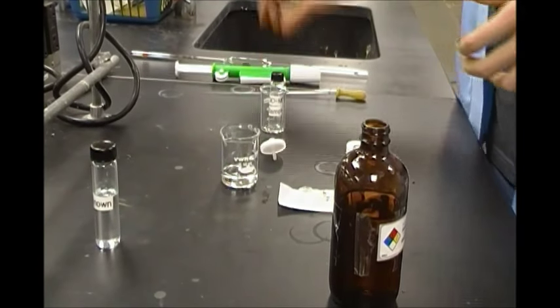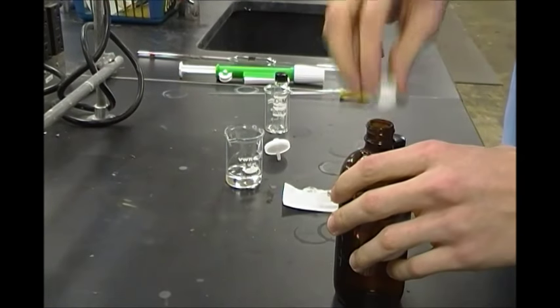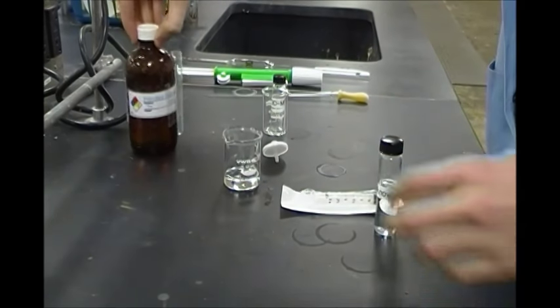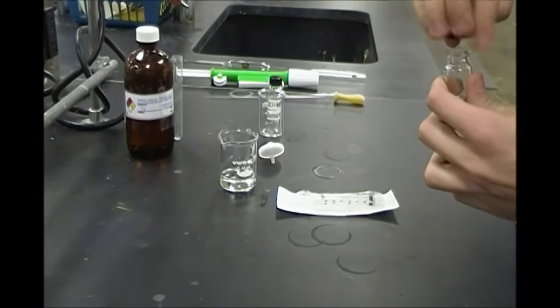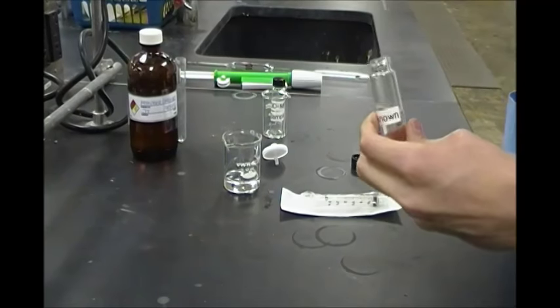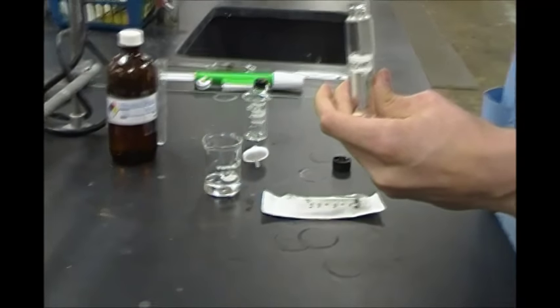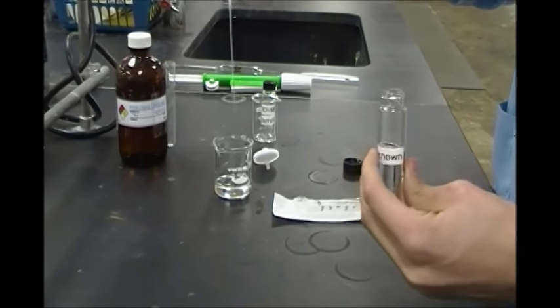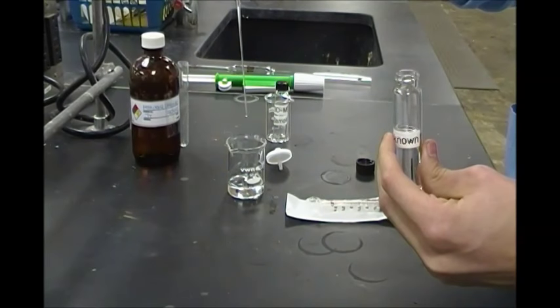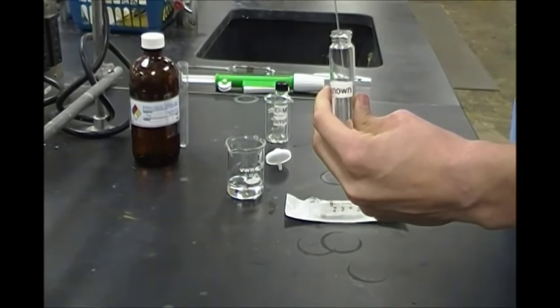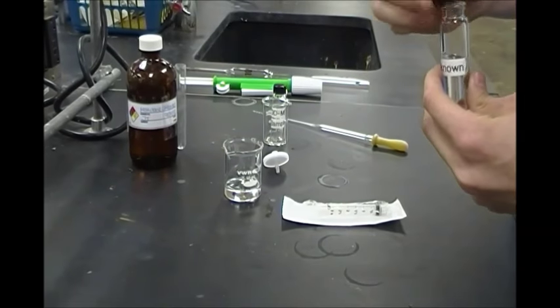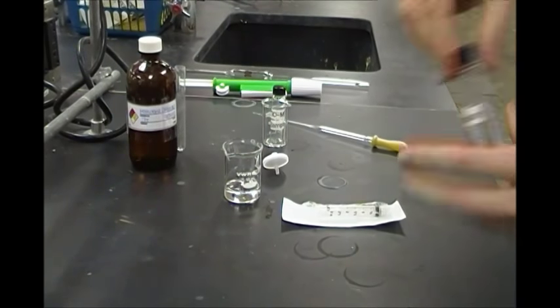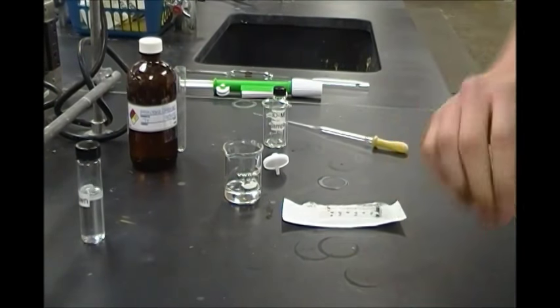Alright, so what we're going to do is dilute our unknown. We're just going to take one drop of our unknown and put it in 10 milliliters. That's a really small concentration, but we want it to be like that. I'll explain why later.